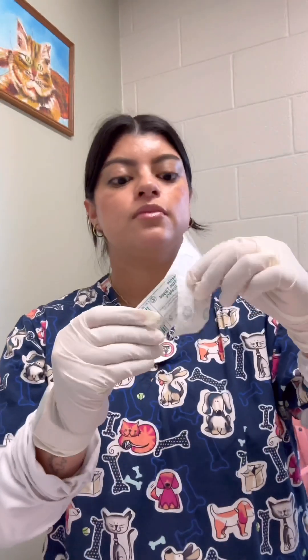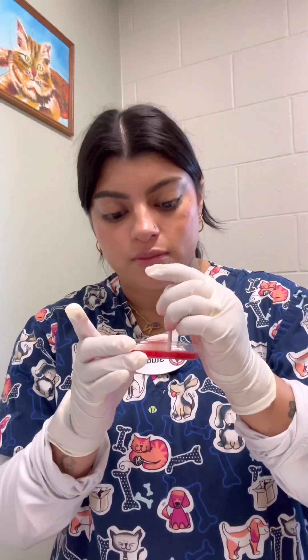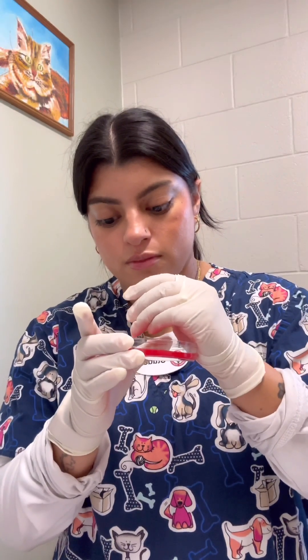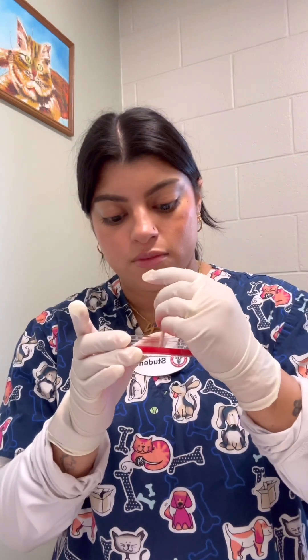Now that I have these onto the surface of the plate, I'm going to use my other sterile swab and just gently push these into the Agar plate. Now that I've pushed the discs into the surface of the Agar plate, I'm going to incubate this upside down at 37 degrees Celsius.